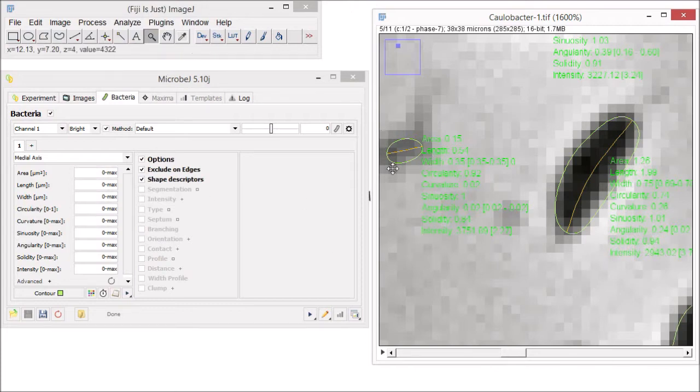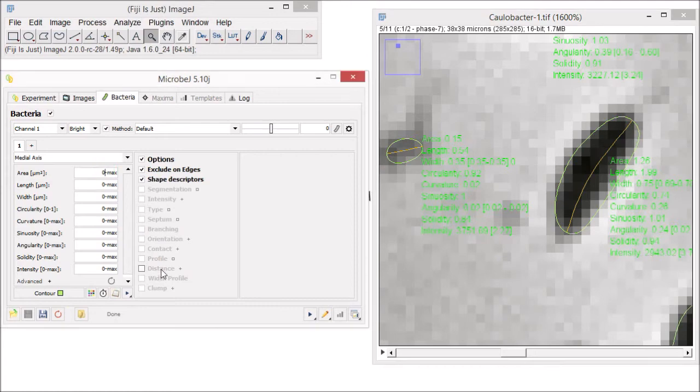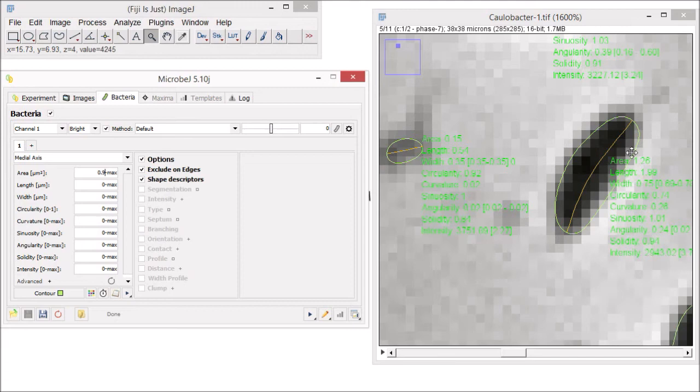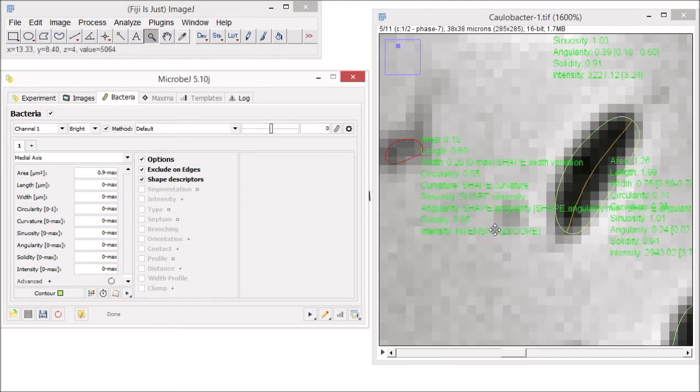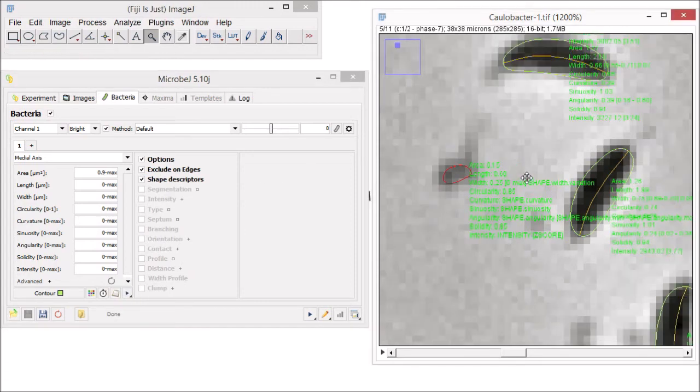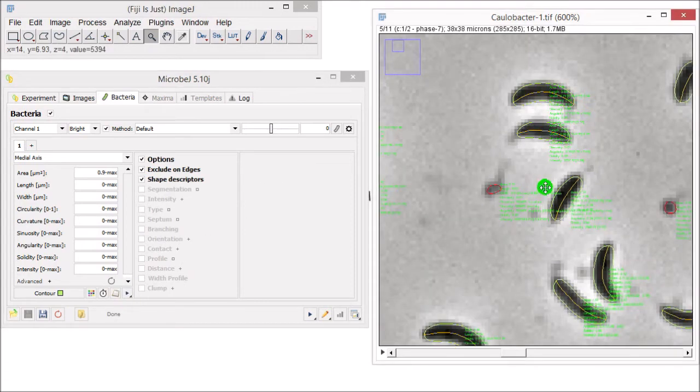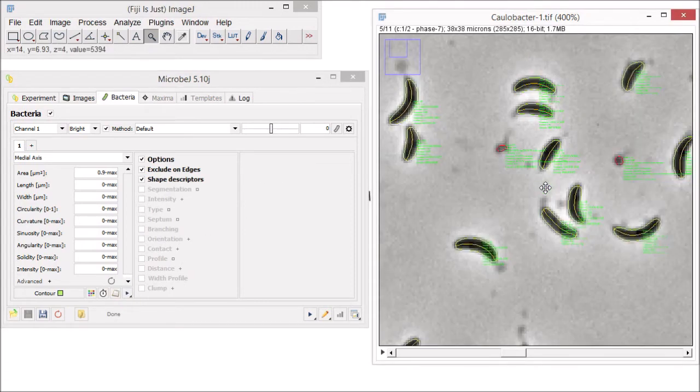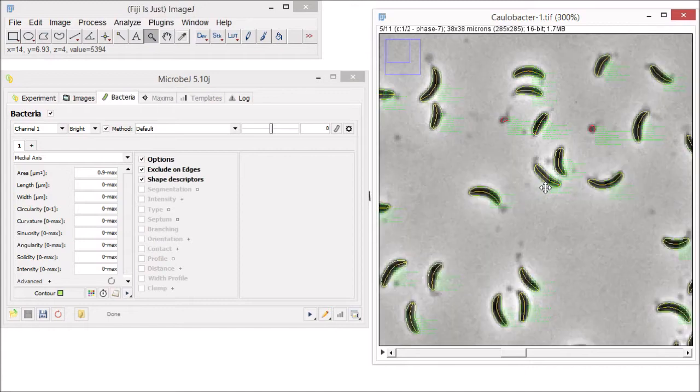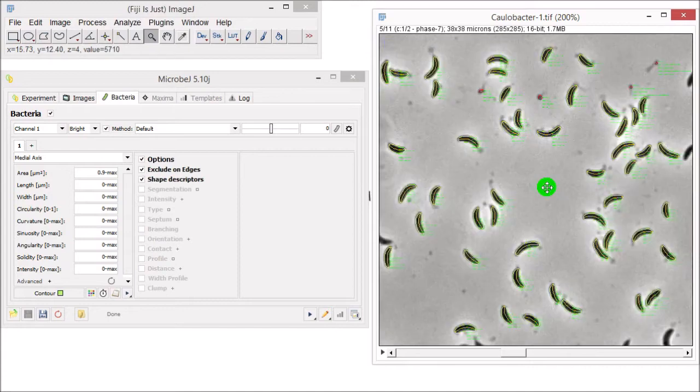So, if you want to exclude this tiny particle, for instance, from the final analysis, just adjust the minimal area to something greater than 0.4 and less than 1 and click on the test button again. As you can see, the particle is turned red and this means that it is now rejected from the final analysis.